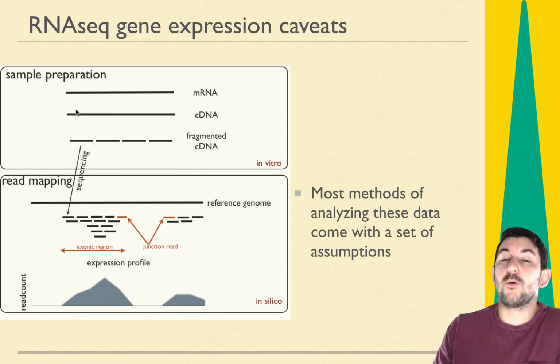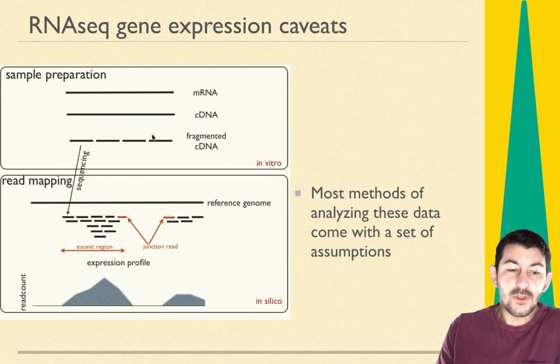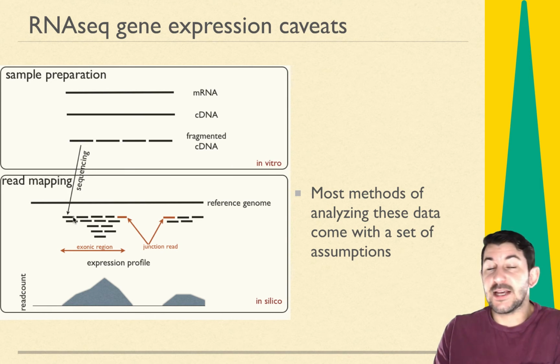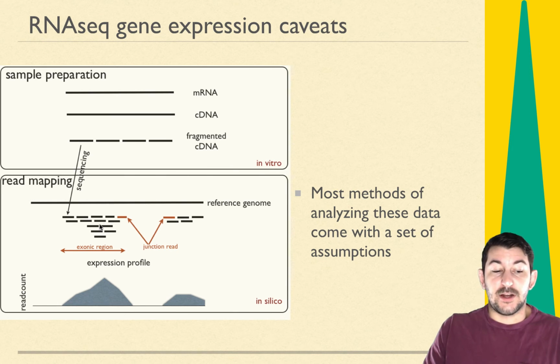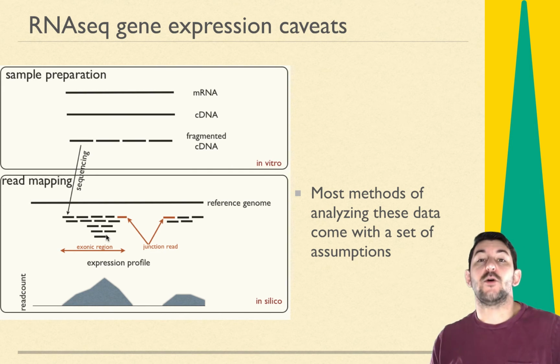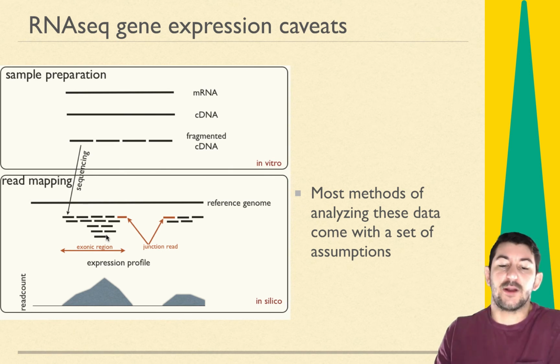And so if we look at what gene expression is being compared as, again, we're starting with mRNA in our samples, we're extracting it, we're fragmenting it and sequencing it through Illumina, whatever you want, and then we're taking those reads like you have done in this class, and you map them to a reference genome. We then use read counts, in other words, count the number of reads that are mapping to a given region, and using that to then go and do our downstream read normalization. Reads per million, or fragments per million, or transcripts per million, whatever you want to do.